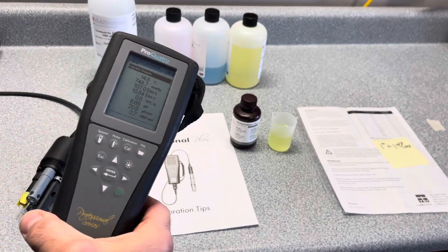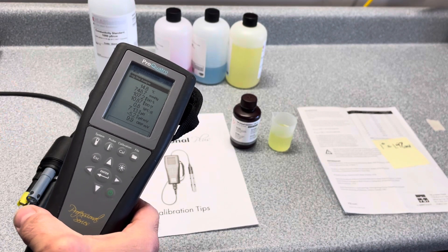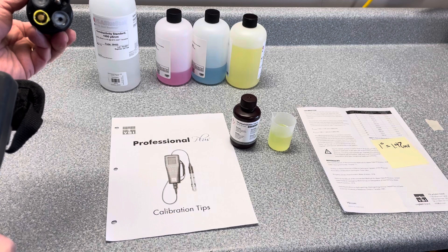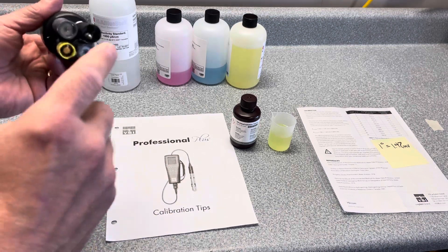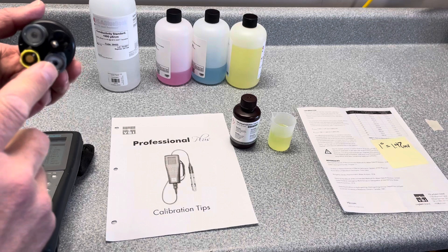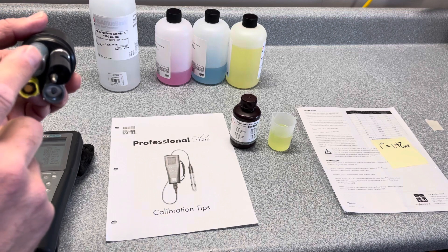Today I wanted to do a walkthrough on how to use the calibration function on the YSI ProQuattro multi-parameter instrument. This particular cable has the Quattro cable with the four sensors. This one has the conductivity/temp, a dissolved oxygen sensor, an ORP sensor, and a pH sensor.